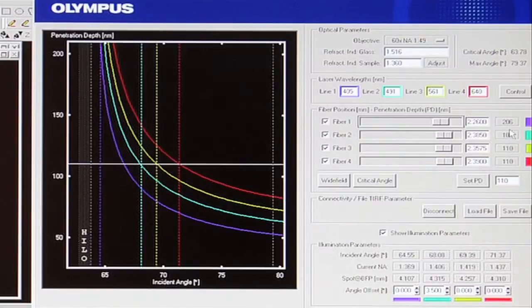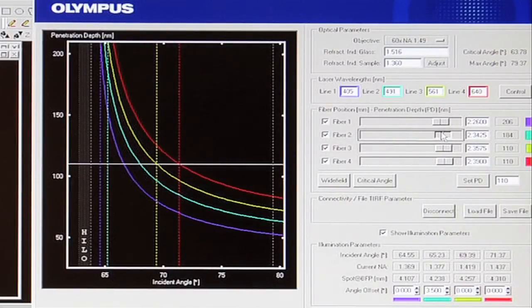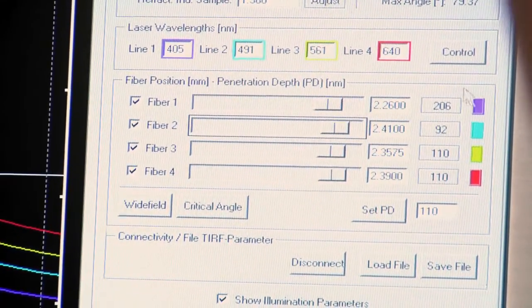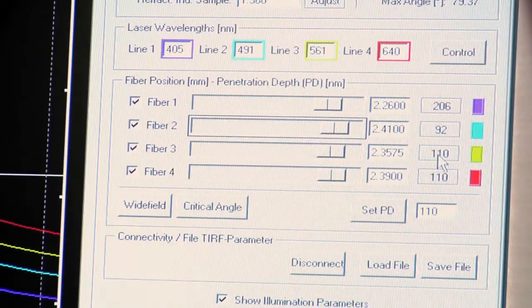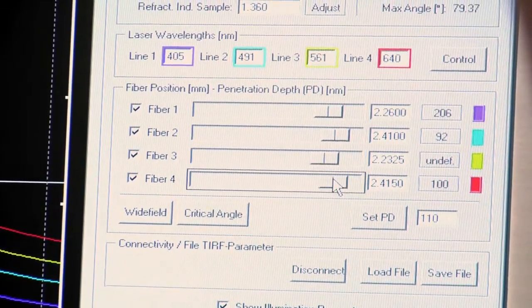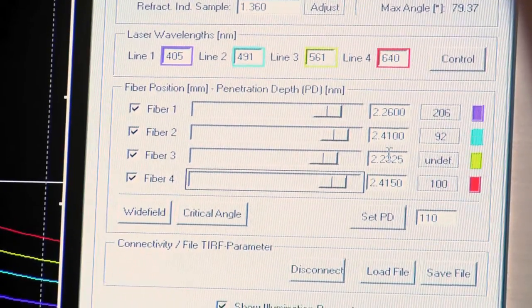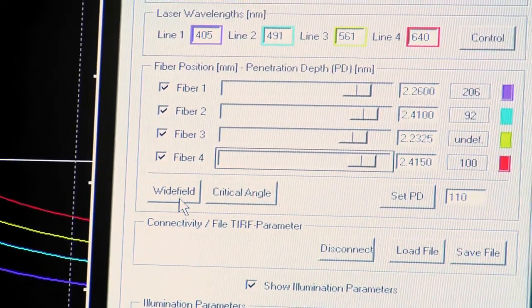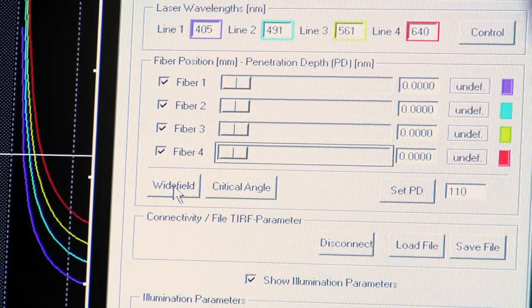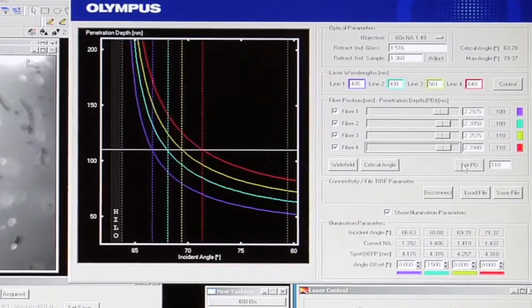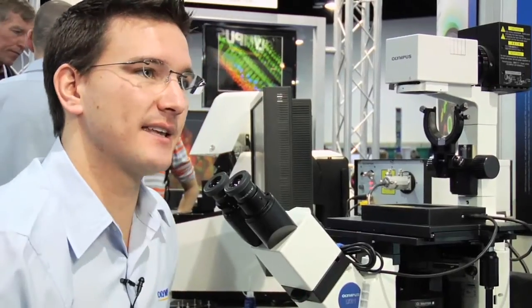We have individual control of each of the lines. So we're really able to go ahead and adjust these individually to make sure that we are achieving the same penetration depth for each of the lines. The same with the third and the fourth. Something that is nice that we can do is if we wanted to switch to wide field illumination. We can do that just by simply clicking here and all of the beams will go to the center of the back focal plane of the objective, giving us wide field. Clicking set penetration depth again takes us back into TIRF.